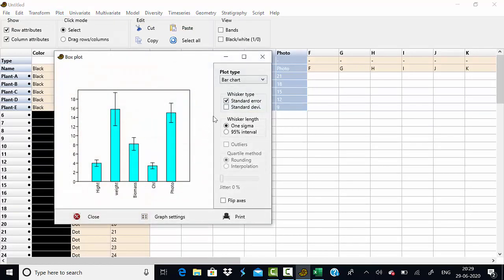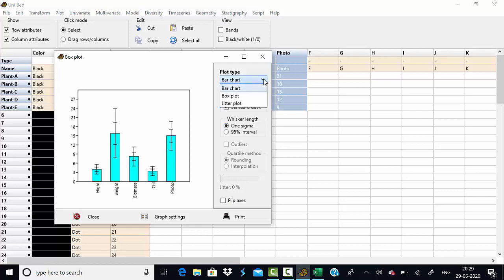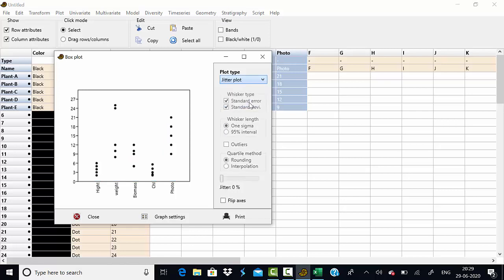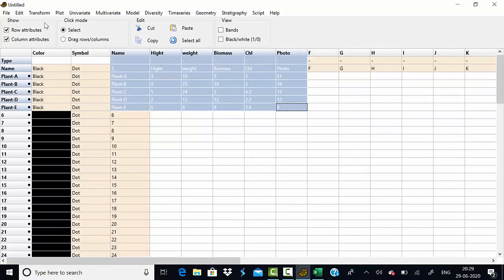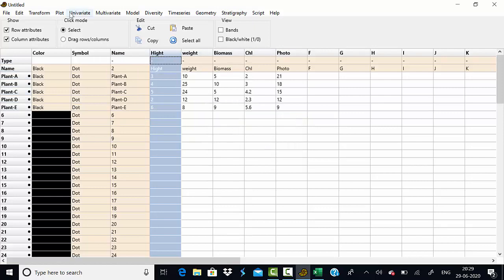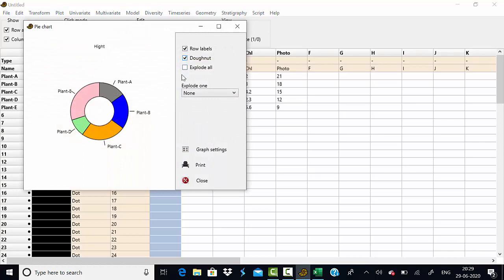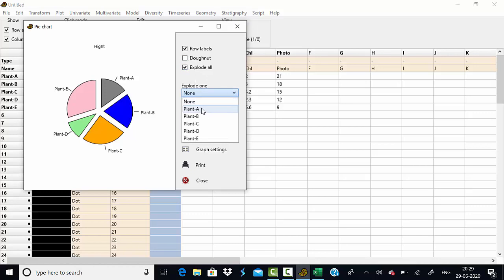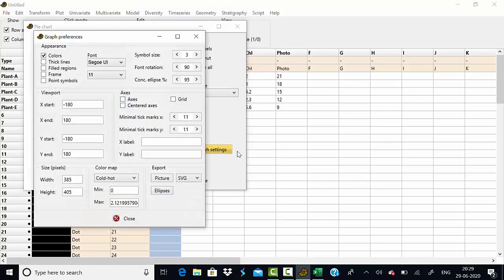You can also display your data using box plots, showing standard deviation and standard error for different parameters. There are different types of box plots, point plots, and jitter plots available. You can export these through graph settings. Additionally, pie charts are available — select a column, go to 'Plot,' then 'Pie Chart,' and you can create and export different types of pie charts.